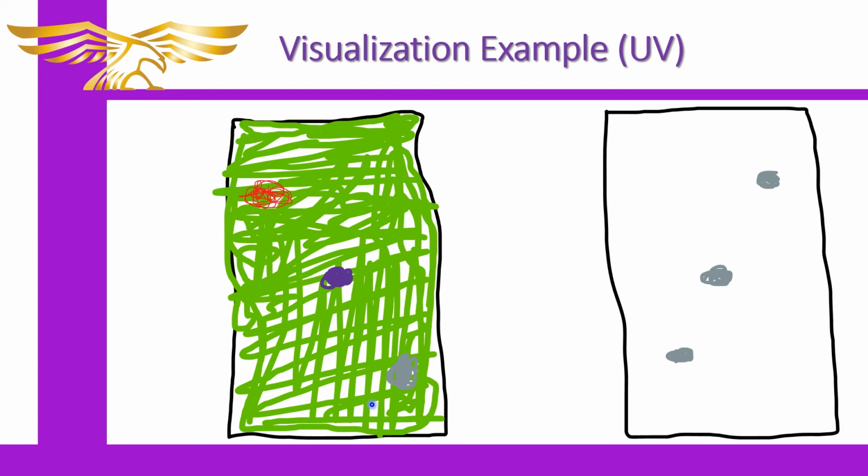This is an example of what I mean. So when you do long wave, you get this nice kind of lime green color, and the spots will be kind of variant in how they're colored. Some are red, some are blue, some are kind of this gray color. With the other, it's more of a fainter gray than this even, and there's no color here.